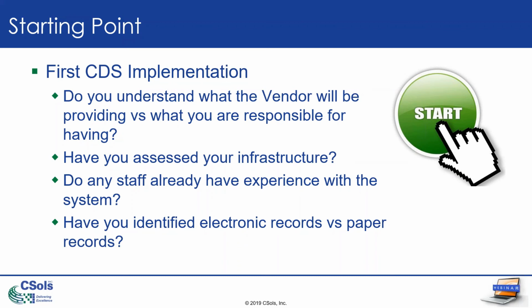If you have anybody internally on your staff that has either used different CDS or have used CDS in general in the past, that can be very helpful to providing insight to how to implement the system, and especially when it comes to things like training or developing documentation. So knowing up front before you get a good way into the project what experience level you have will help you understand how you need to staff your project team.